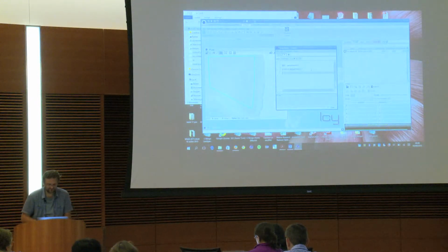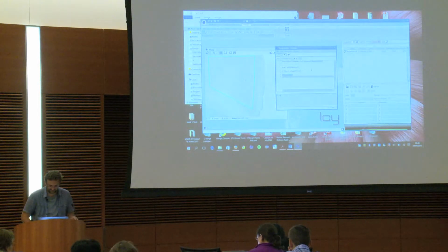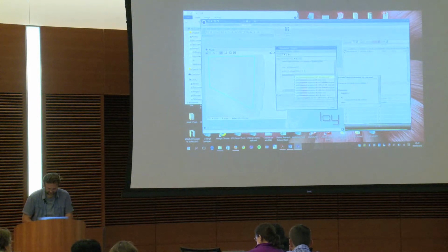And this is if you want to, let's say you want to perform a crop, or I don't know, you type sequence util, and here I'm going to load a library. I press enter, and then the import is made. You see at the top. And then you press dot, and you say you want to extract a channel of my sequence sec. And the channel I want to extract is channel number 1.